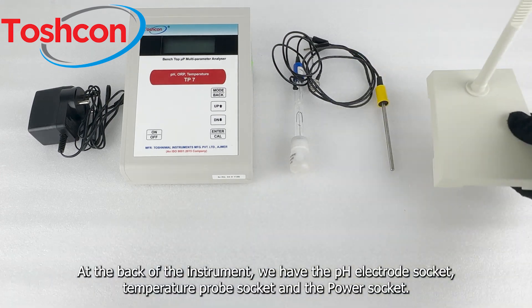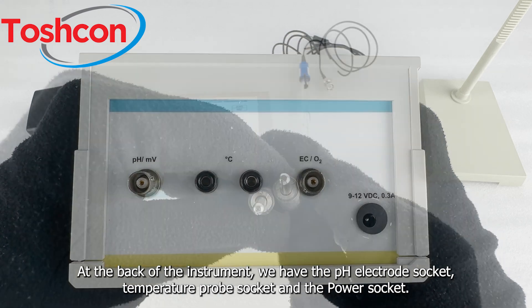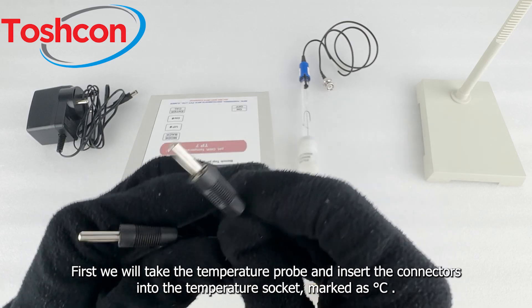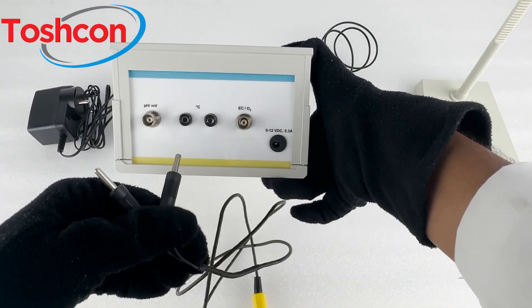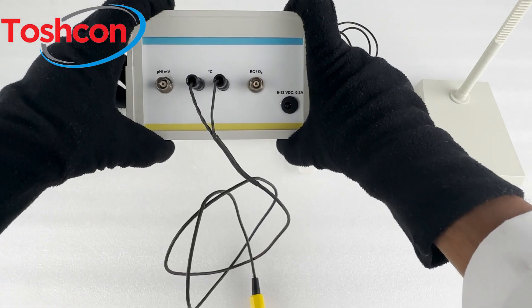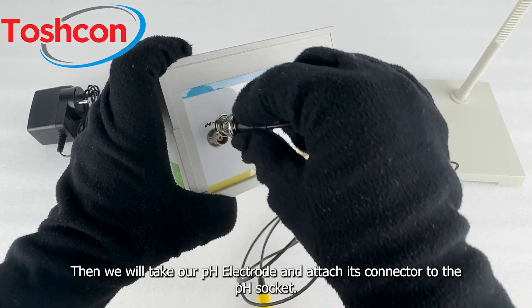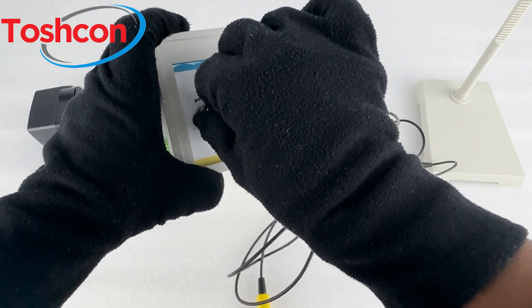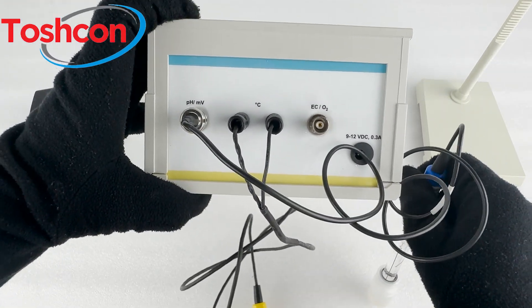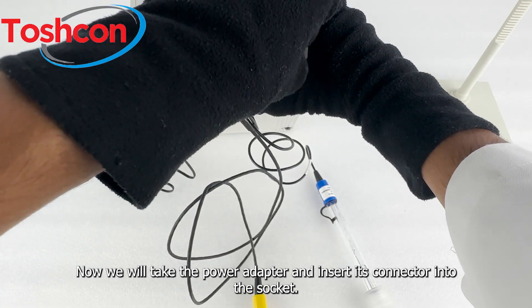At the back of the instrument, we have the pH electrode socket, temperature probe socket, and the power socket. First we will take the temperature probe and insert the connectors into the temperature socket, marked as degree Celsius. Then we will take our pH electrode and attach its connector to the pH socket. Now we will take the power adapter and insert its connector into the socket.